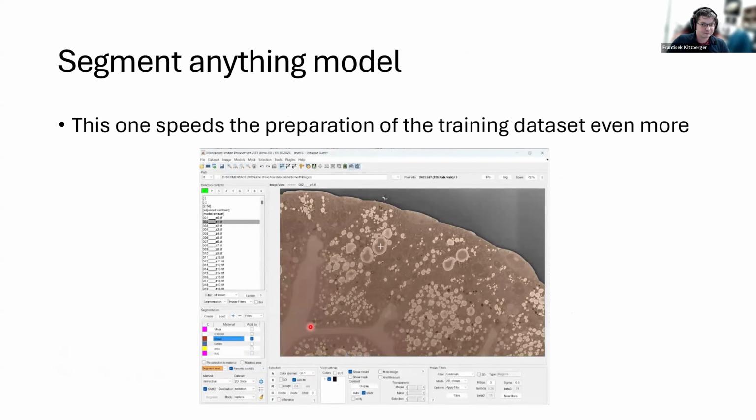This is the tissue. This is the lumen. This is the lumen, and this is the lumen. Now the nuclei. Sorry, this is a GIF, I cannot skip it. So these are the nuclei, and everything is just one click. No superpixel clustering, nothing. Only it's quite GPU heavy. That's the only downside to it. But I think the speed balances some of the cons, because it is really, really fast. You can see that even the vesicles could be segmented like this pretty fast and pretty straightforwardly.